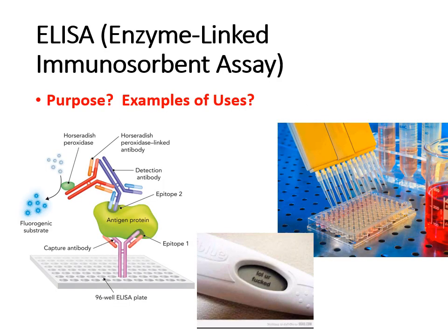And then the last technique that I want to mention today is one near and dear to my heart because it relates to microbiology, which is one of my favorite classes to teach, along with genetics as well. And so this is ELISA, and ELISA stands for Enzyme Linked Immunosorbent Assay. And this is very valuable to us. It's a technique that allows us to detect particular proteins in a sample.